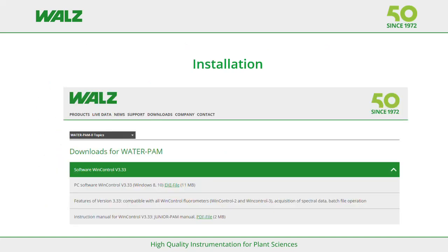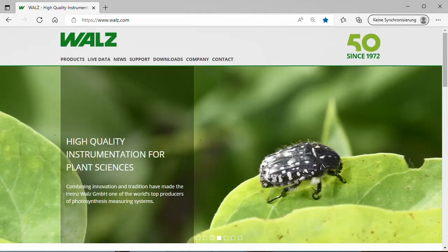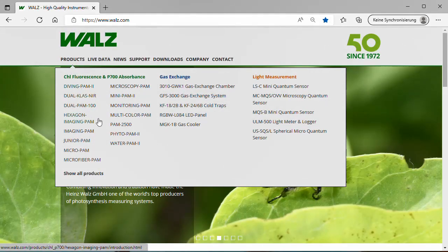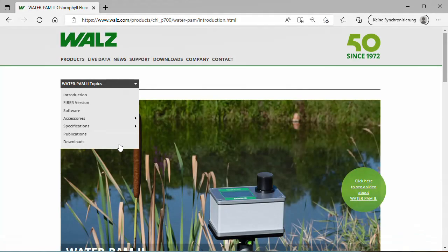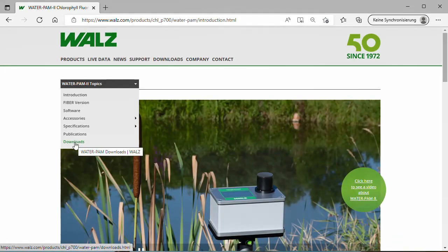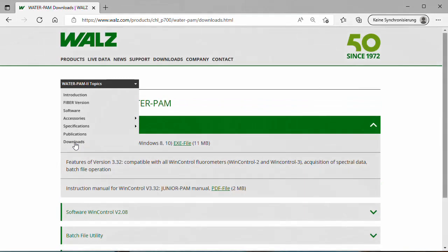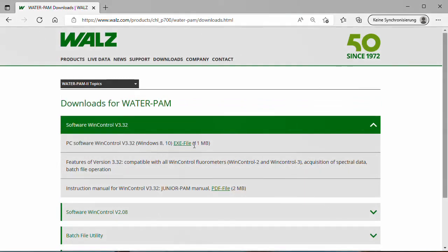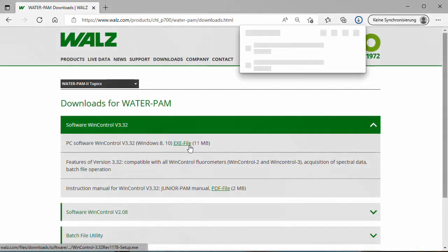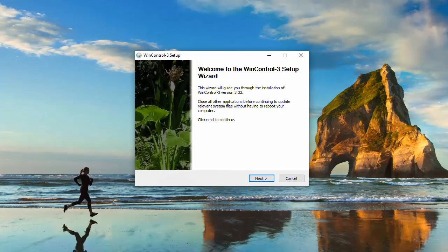I start with software installation. We provide free software and software updates for our instruments. Please visit our homepage walz.com. In products you will find our instruments — choose your instrument, today it is WATER-PAM-II. The menu bar of the WATER-PAM-II product page gives access to the download area where you can download the software setup file.